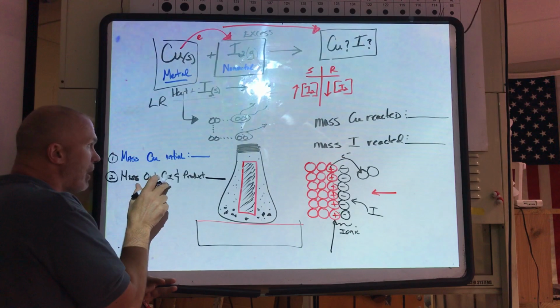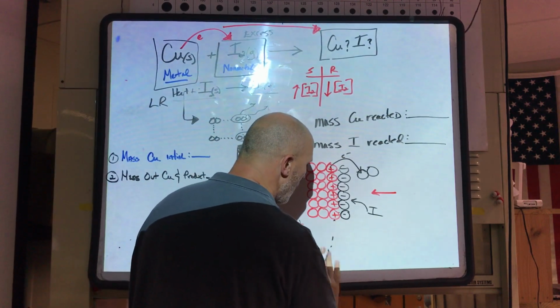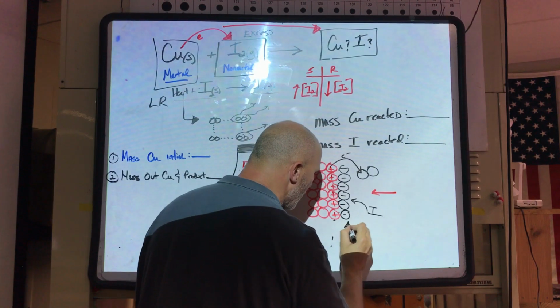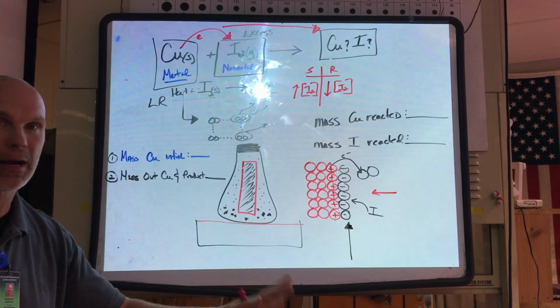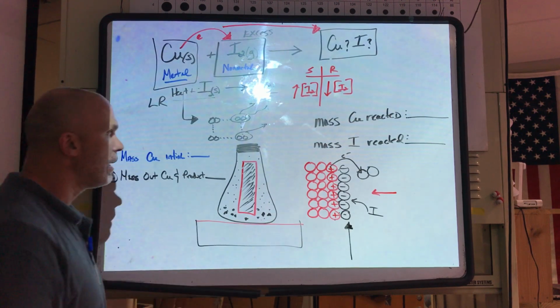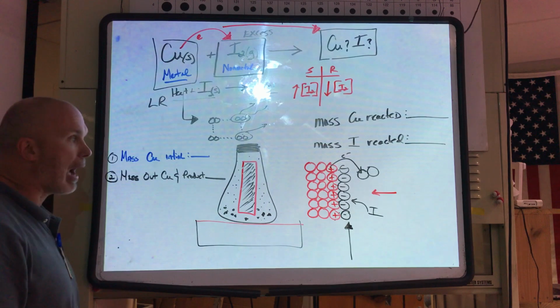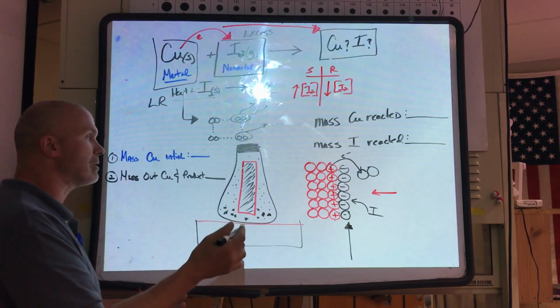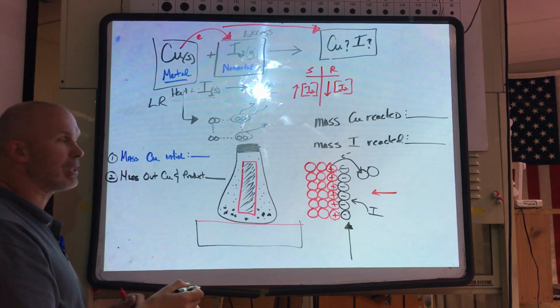This is going to be bigger than that. And what do I have here? What did I really add here? Yeah, I really added iodide ions or iodine. So this is heavier because of the extra what? Iodide atoms, or ions in this case, that are now attached to the copper plus 2 that was in that crystal position.